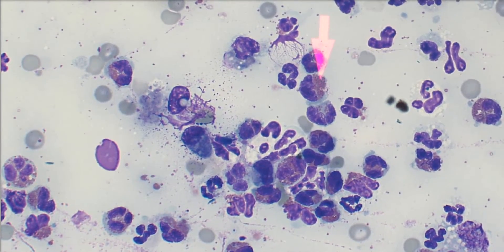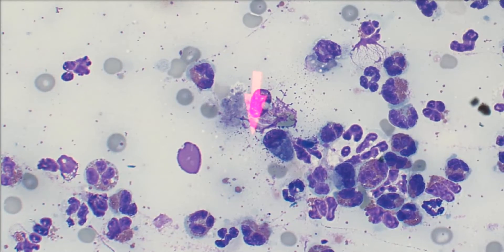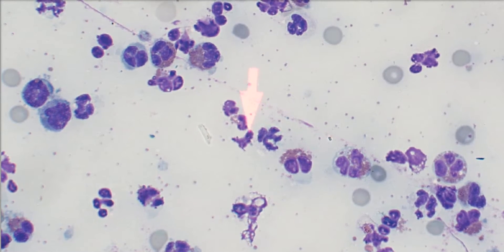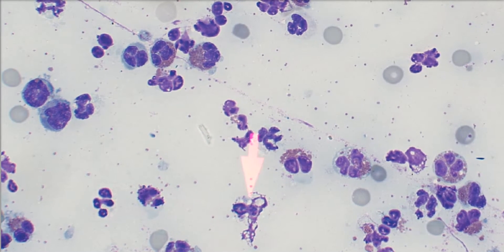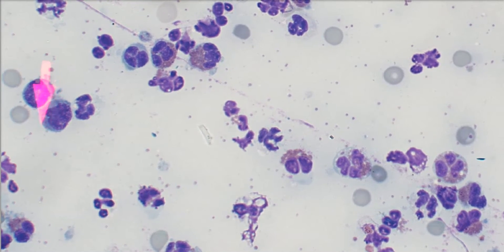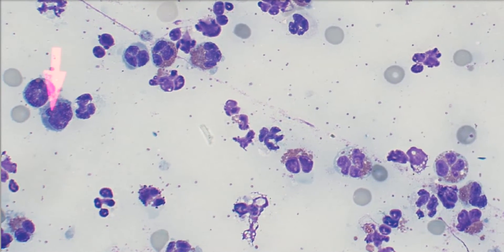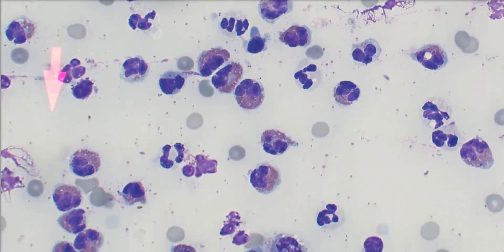We also have some macrophages. Here's a macrophage here — kind of getting squished. There's a bunch of debris in the background; all these little dots are just debris. This is a ruptured cell, just blown apart, so we just ignore that. A couple of macrophages over here — you can see they have kind of an irregular nucleus and a little bit less cytoplasm than macrophages typically do. These are not lymphocytes because they have more cytoplasm than lymphocytes typically do, and their nucleus is more irregular.